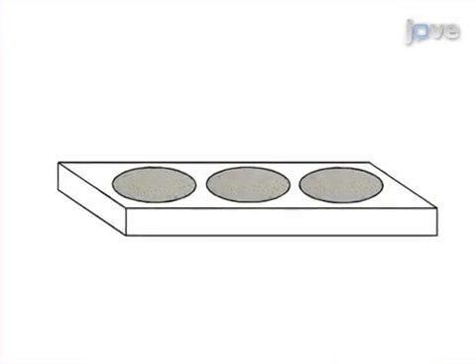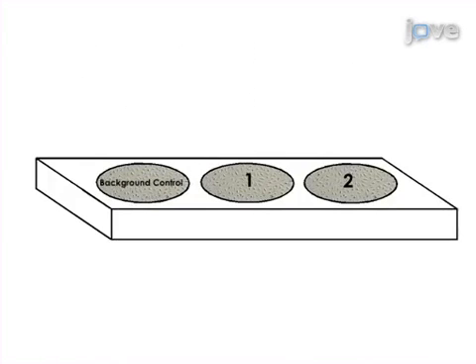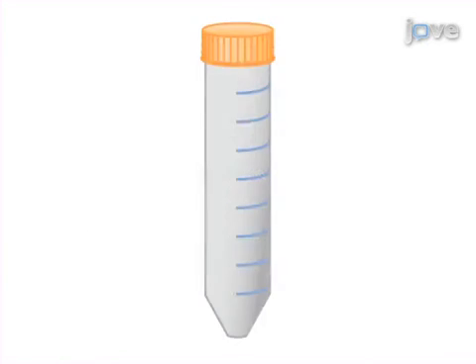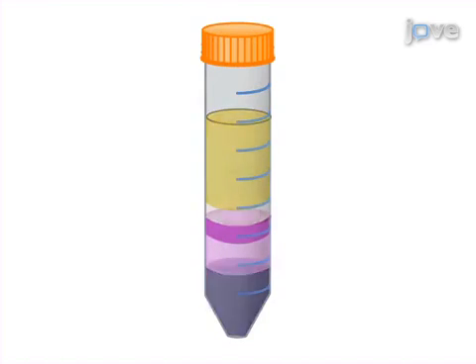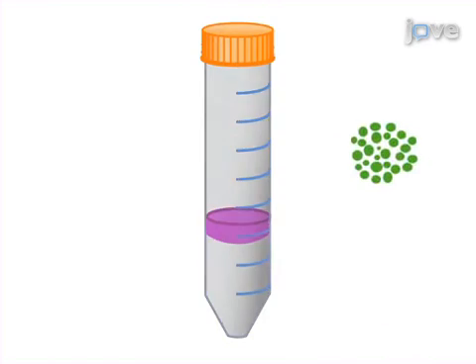This is accomplished by first treating healthy, confluent monolayers of microvascular endothelial cells with the desired experimental stimulus. During the second step, neutrophils from healthy human volunteers are isolated and then labeled with calcein AM.